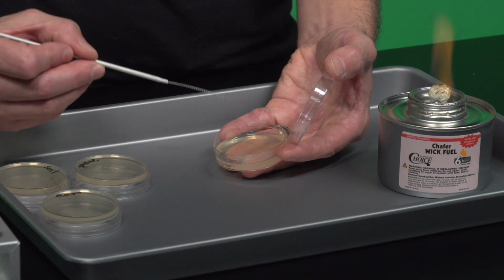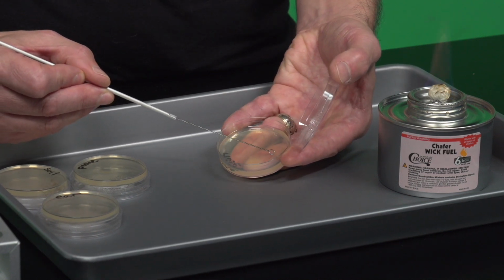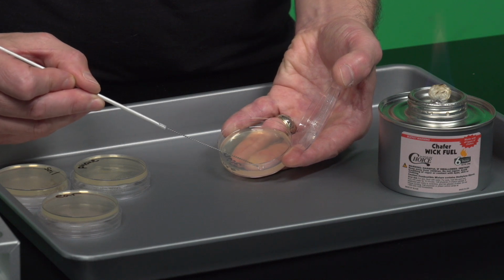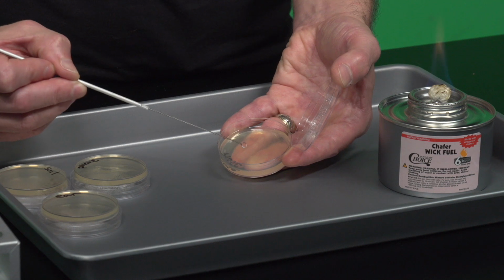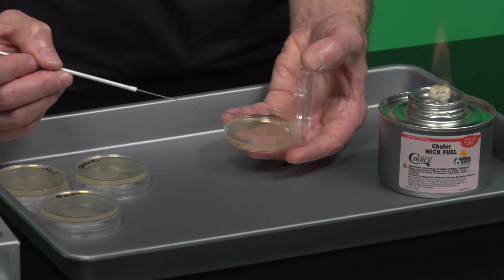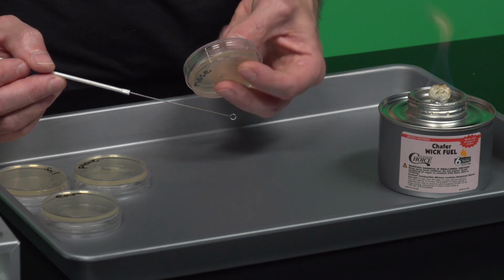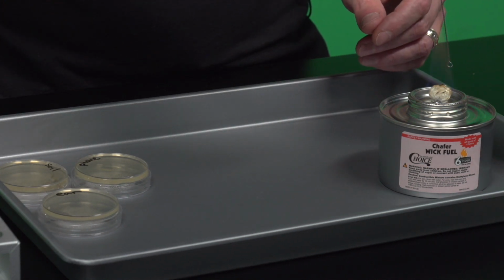Okay, now that this is cool enough, I'm going to go from quadrant 3 into quadrant 4, back into quadrant 3, back into quadrant 4, and now I'm just going to stay in quadrant 4. The key thing is when I'm doing this, I can see the streak marks. It's just hard for me to look at it and at the same time show it to you on the camera. Once you're done with that, I'm going to take this and put it outside of my tray. That way I know that I've already done it.